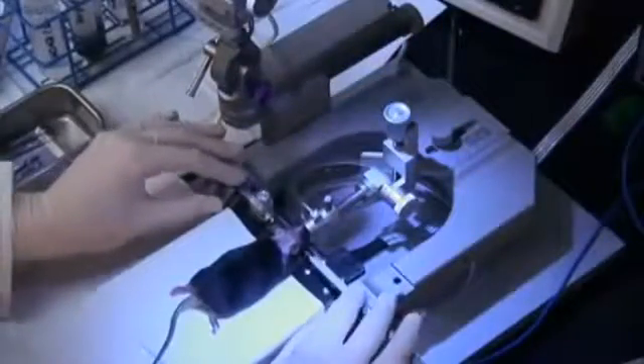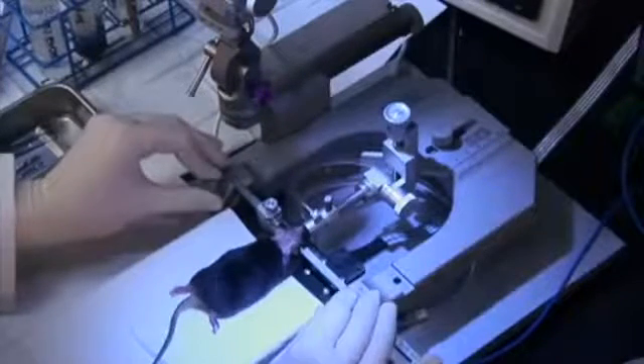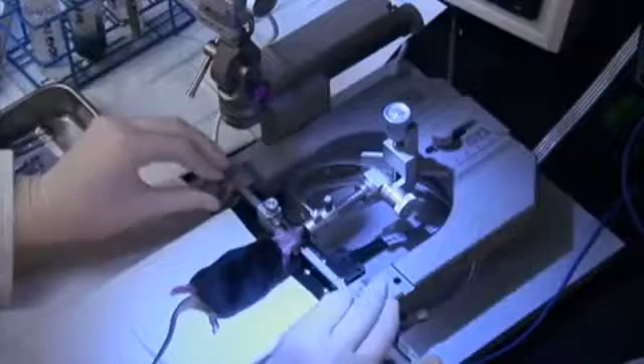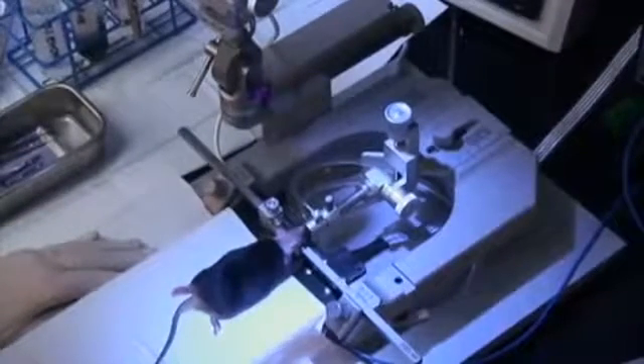Push the nose cone over the nose and direct the gas flow to the stereotax to keep the mouse anesthetized. Secure the head with the ear bars. Leveling ear bars are used here, though to target the lateral ventricle, a perfectly level skull is not necessary due to the large size of the ventricle.